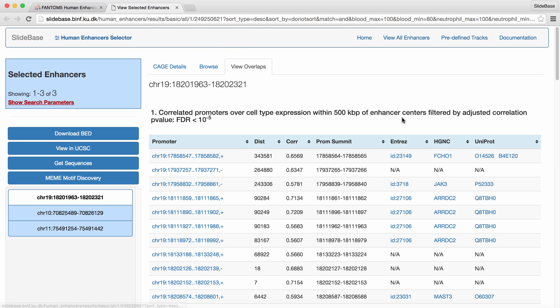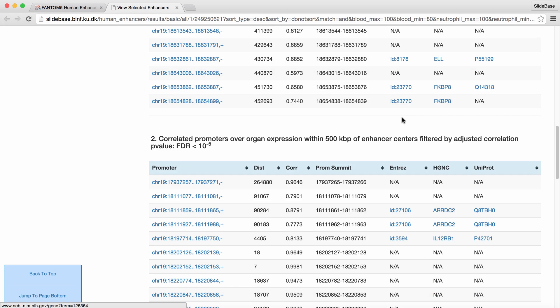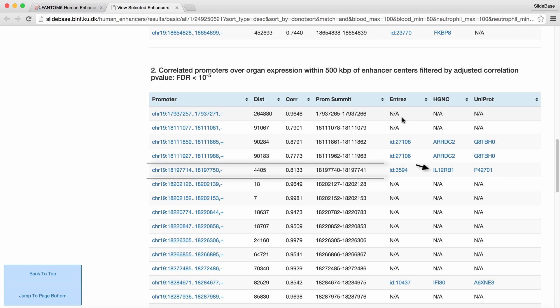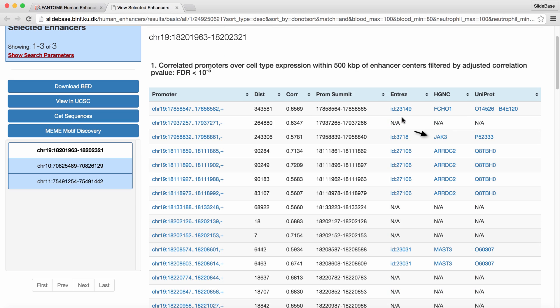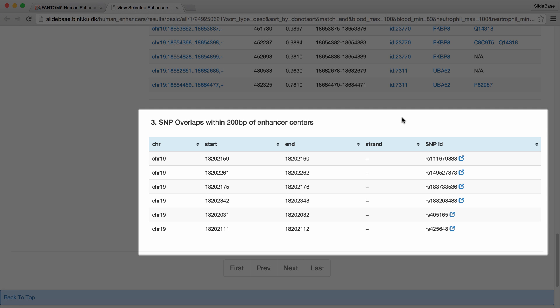If we move to the last tab, we can see if the enhancer expression is correlated with promoter expression over the cell and tissue samples. We can observe that the enhancer correlates with a number of anonymous Phantom 5 promoters, along with Phantom 5 promoters associated with known genes. It is good to see that an IL12RB1 associated promoter also correlates with the enhancer. Among others, we can see the JAK3 gene, which is predominantly expressed in immune cells. In section 3, we can check if there are any SNPs overlapping enhancers. In this case, we have a number of SNPs for which we can view more details by clicking the links in the last column.